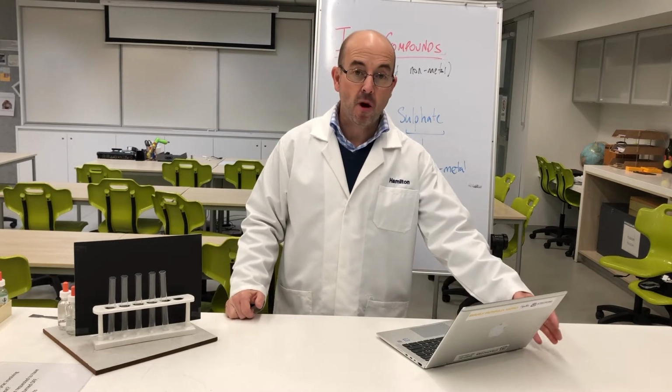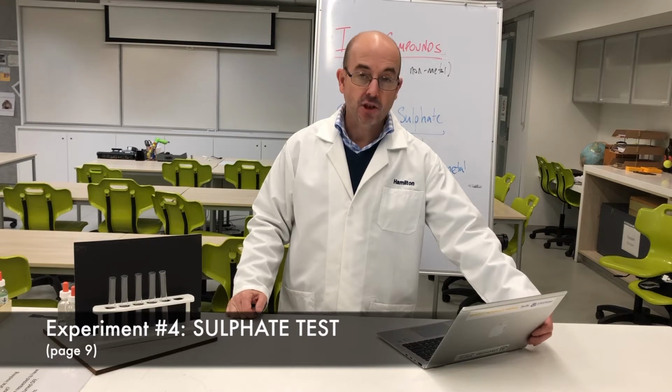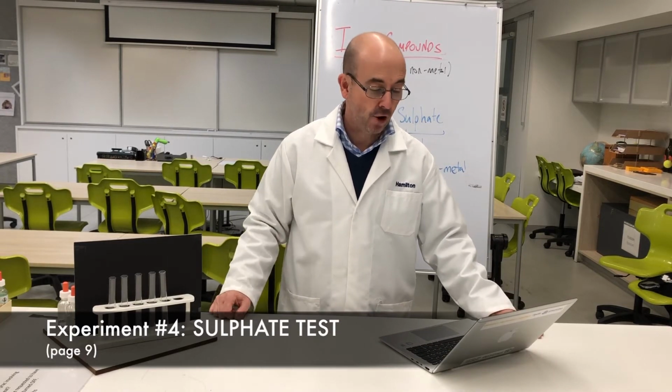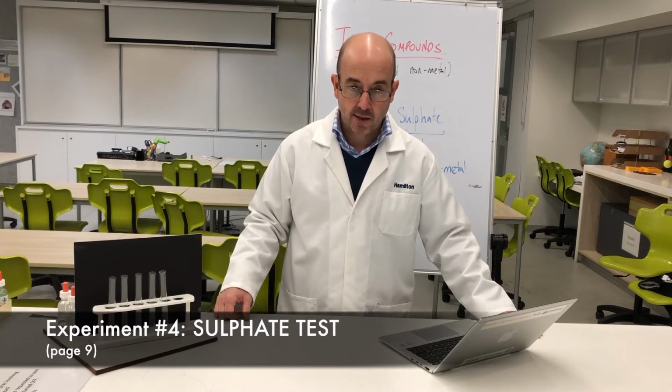We're moving on to experiment 4 now. You can find experiment 4 in your practical booklet on page 9. And experiment 4 is working out the non-metal part of the compound, still working out the non-metal part of the compound, but now we're looking at the sulphate test.